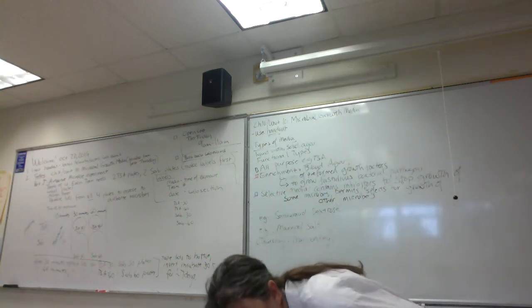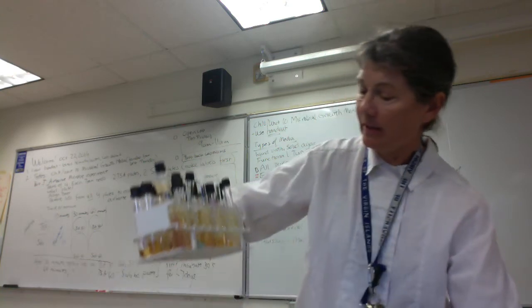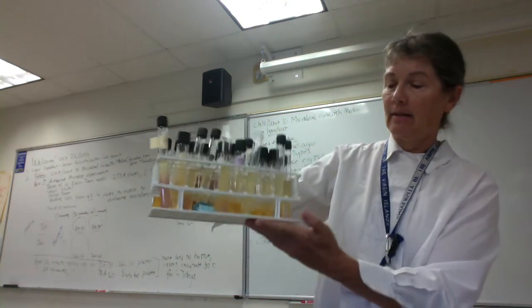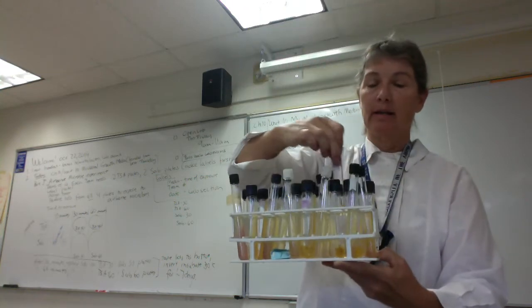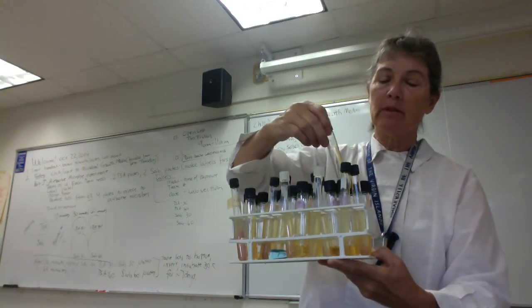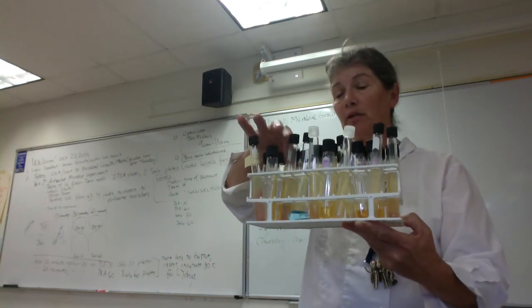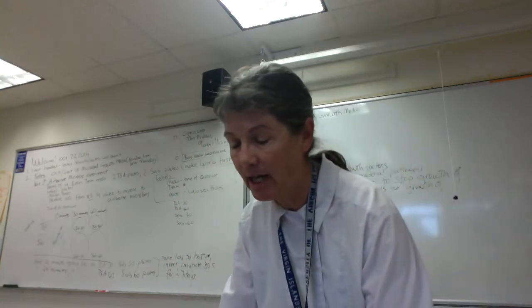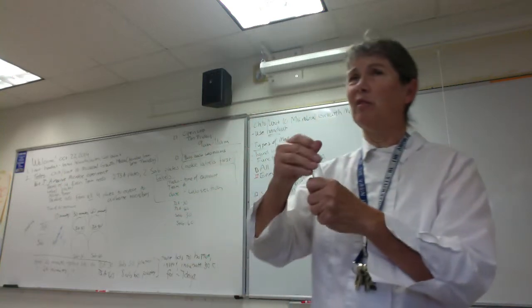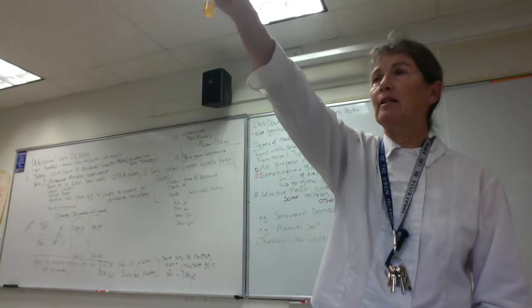So let me see if I can find a cloudy broth in this selection. Let's take a peek here. I thought we had one yesterday. Okay, so if we have cloudiness in our broth, turbidity, we know cells are present. Can we know with certainty, folks, if the cells are alive or dead? No, we won't be able to know that. This is an example of turbidity. See how cloudy it is?